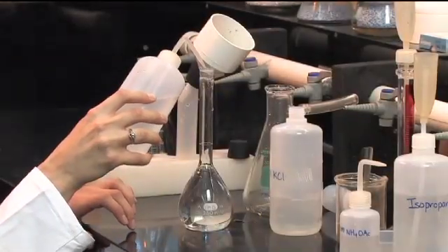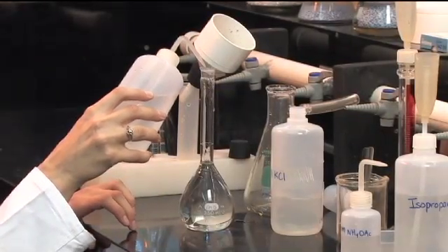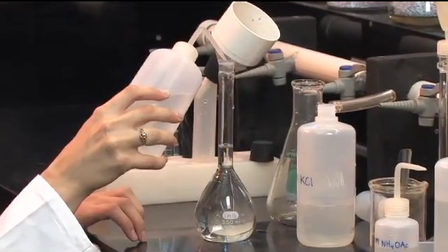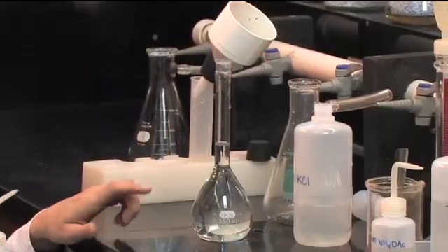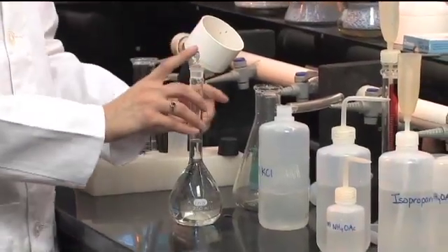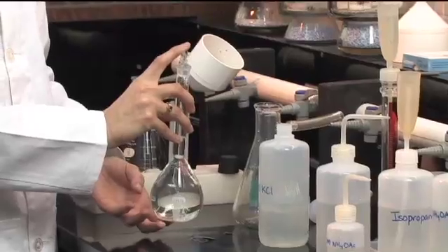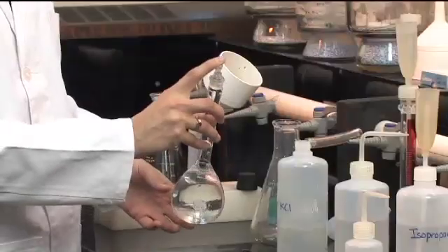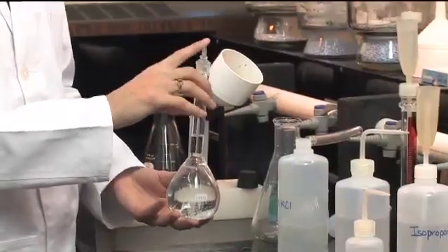Once we've made it up to volume, we need to mix it. Stopper it up, and when mixing volumetric flasks make sure the air bubble goes all the way to the bottom and all the way back up to the top of the neck so that it's thoroughly mixing. It's safe for most solutions to invert it 15 to 20 times for full mixing.